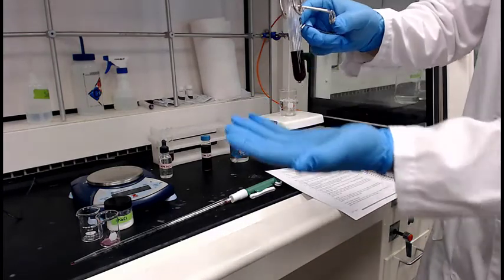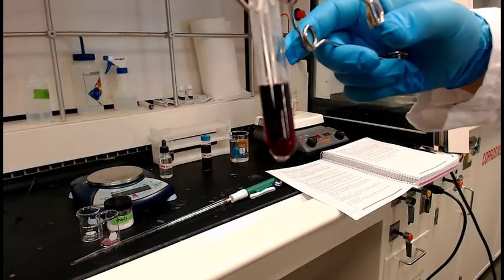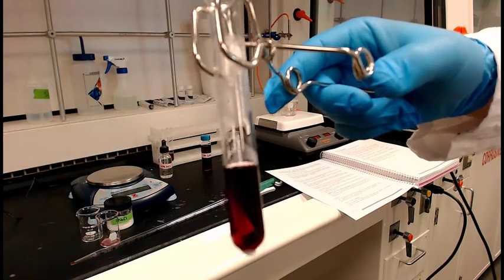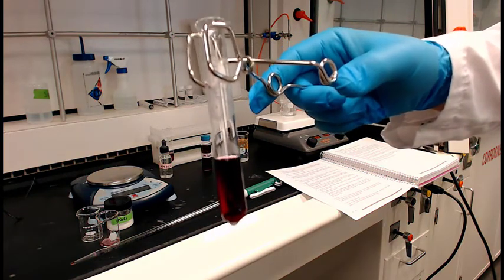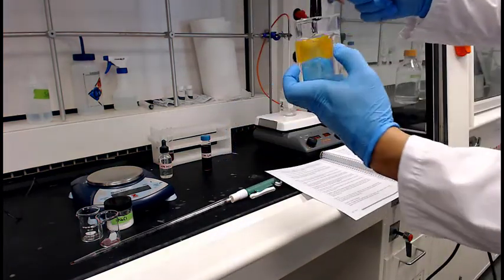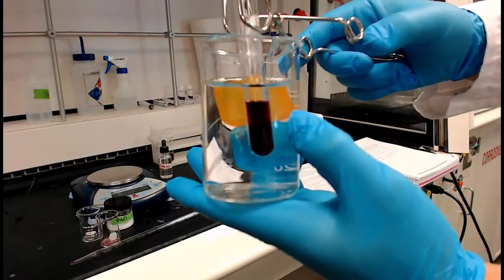So remember what we did. Good. Oh wow, looky there. I have to admit the color isn't too visible on the video, but it pushes it hard. I do see it in person. And then if you let it cool, and he's letting it just cool off in the room, it'll start to shift back on its own. Now he's going to plunge it into the cold bath. Oh, good. This is a really good reaction. This will be a little bit more dramatic.